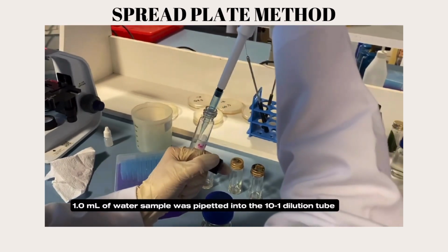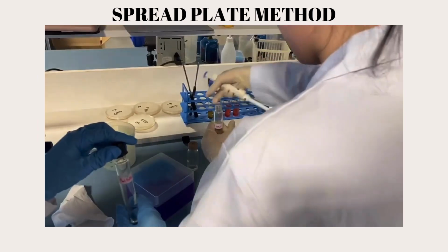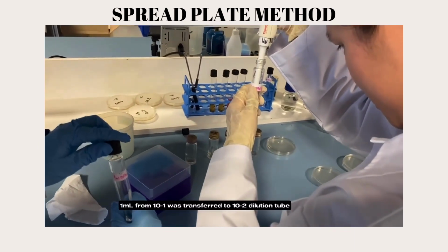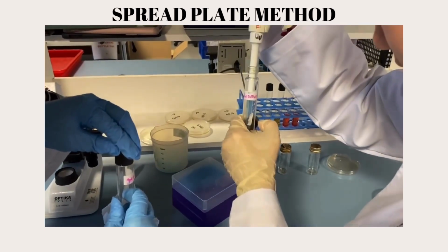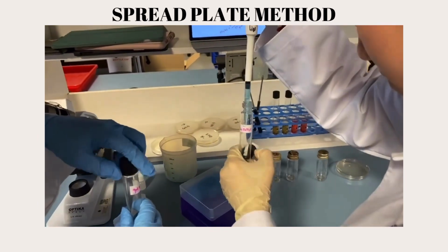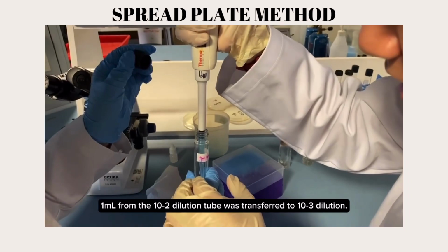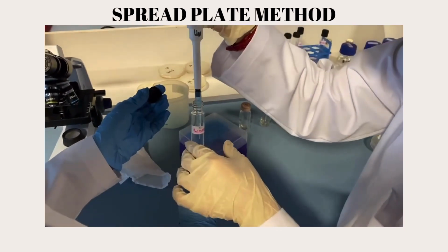1 ml of water sample was pipetted into the 10 power of -1 dilution tube. 1 ml from 10 power of -1 was transferred to the 10 power of -2 dilution tube. 1 ml from the 10 power of -2 dilution tube was transferred to the 10 power of -3 dilution.